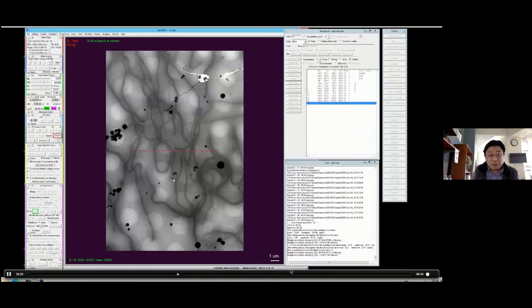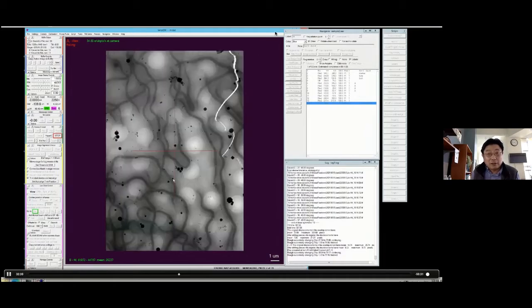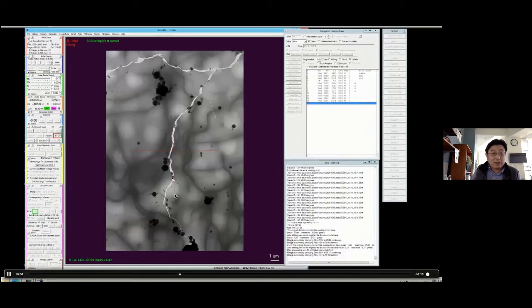So after this one, we are finished. And also you can see this is the time. This will take another 12 minutes to finish all the sites in the project. And I don't want to wait for 12 minutes. So I said, okay, why not stop it? So I asked to end it. So I want to start to collect data.